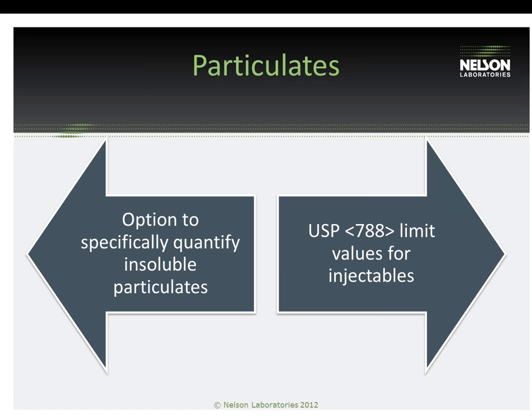What we're talking about with particulates and this insoluble debris left over on the device, these are often maybe metal flakes or particulates, anything that you can see, and a lot of the times our clients know if they're concerned with some of these particulates or metal flakes or things of that nature. And sometimes people want to identify and quantify these separately. The test method for this particular test is USP 788.